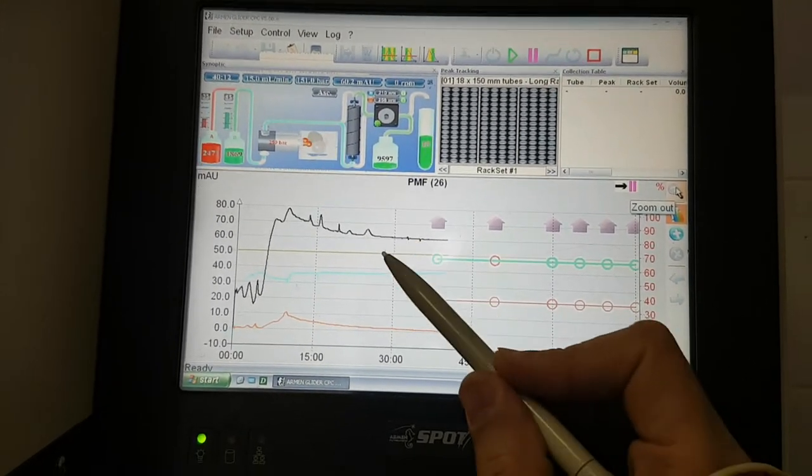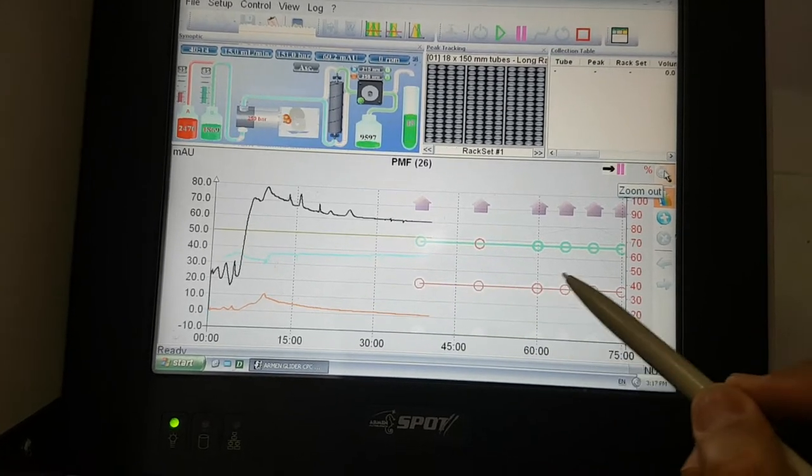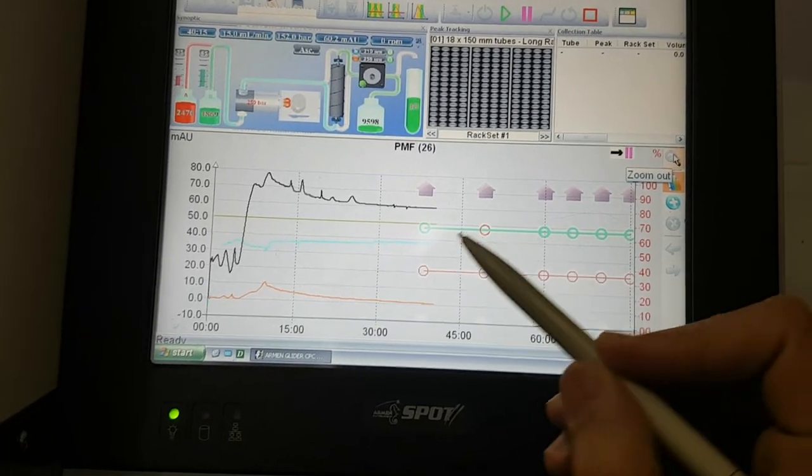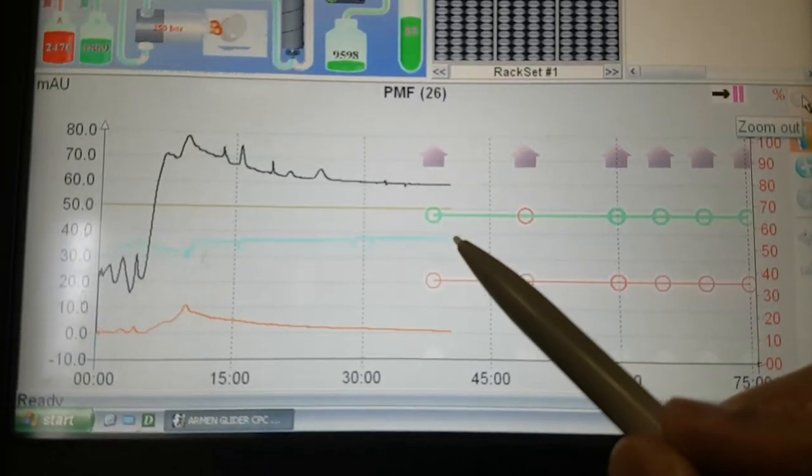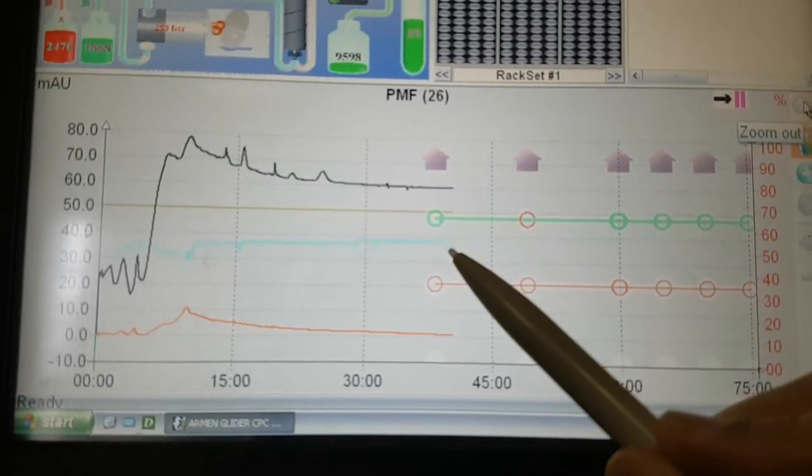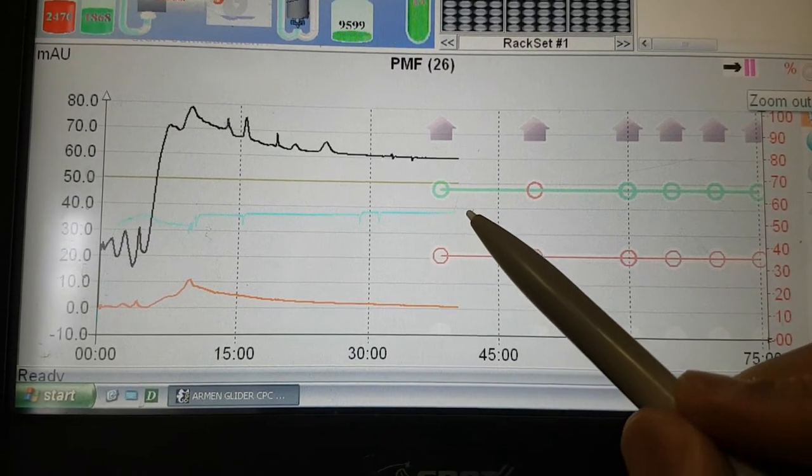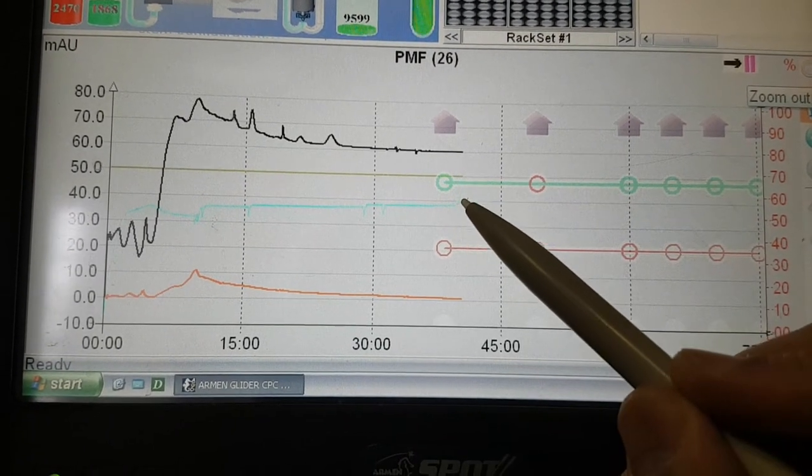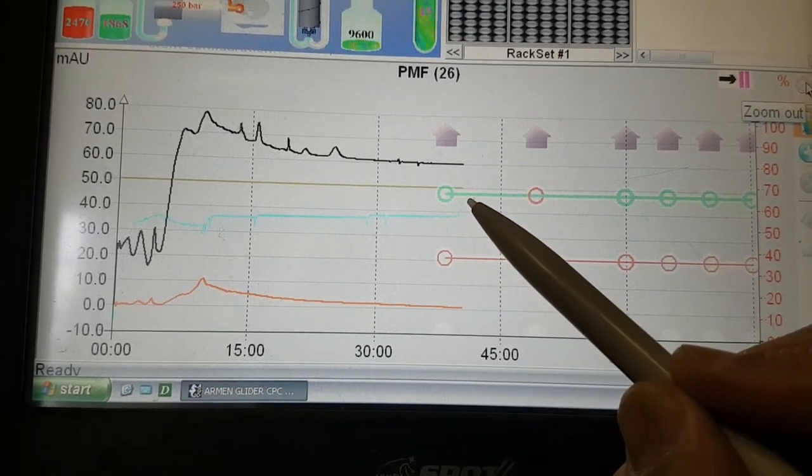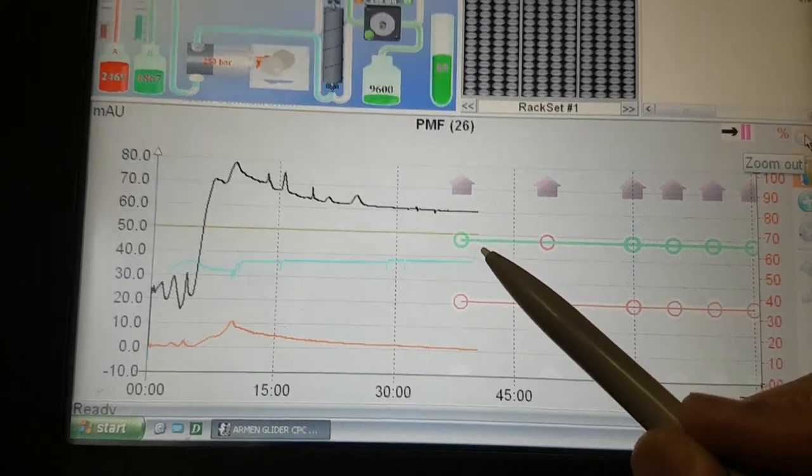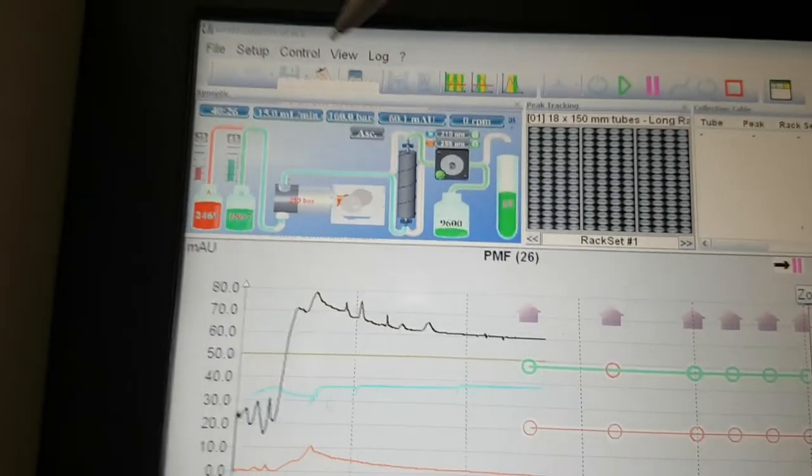After washing of the column, now we started our elusion system. As you can see here, the line of pressure is increasing. It's not the same as before.